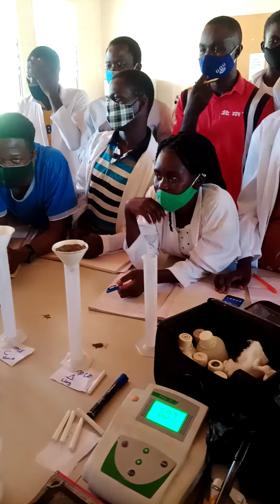When you reach 1, you wait until you hear 0. Then you go. Please, you immediately stop. First, hold on. You stop immediately when you see a first drop.